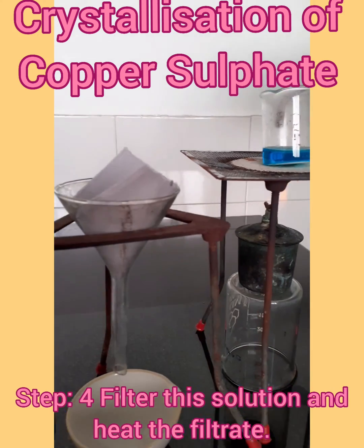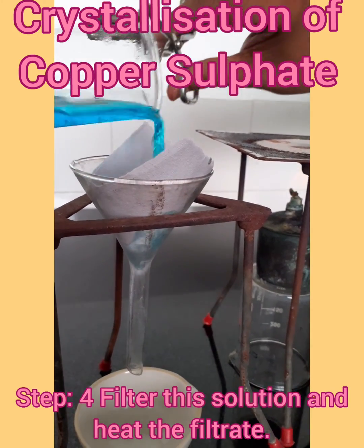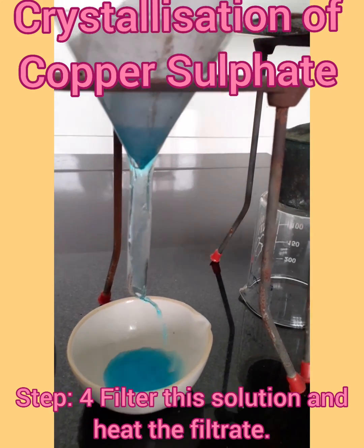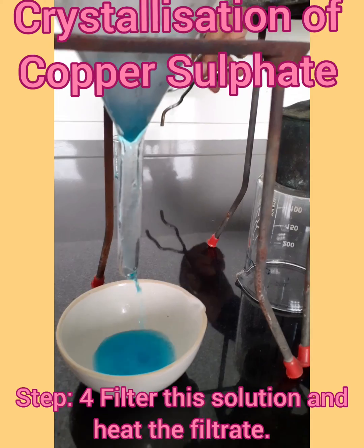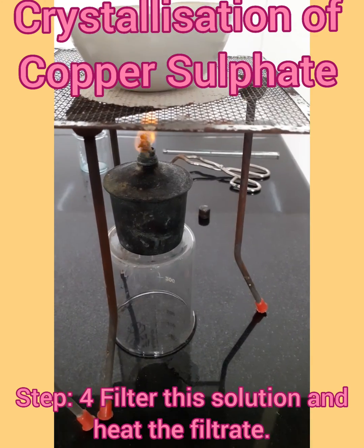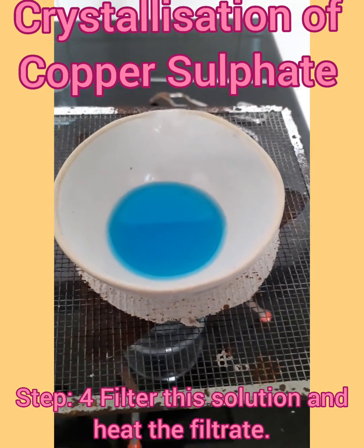After this, we will put this into the filter paper for filtration. The filtrate will be obtained in a china dish, which will be heated again. Now this copper sulphate solution has been put on the heat so that it gets heated.